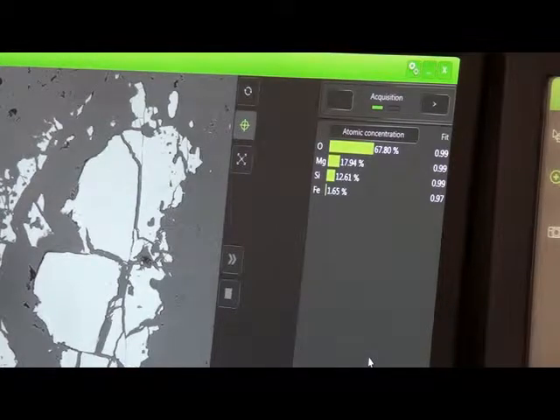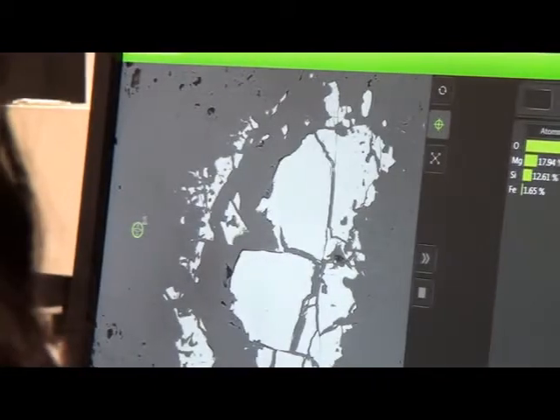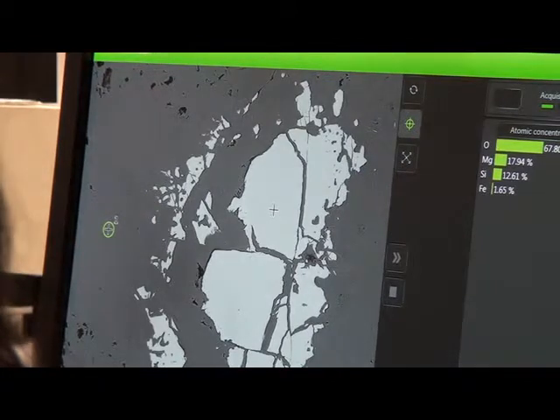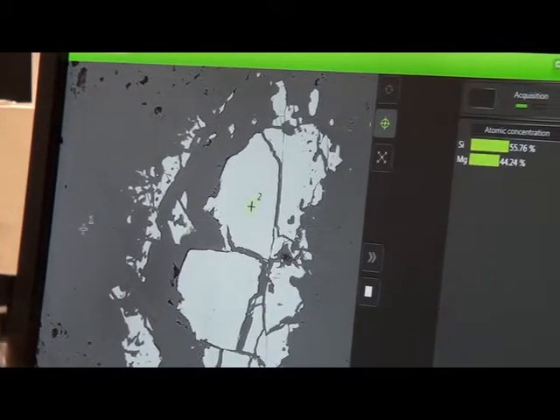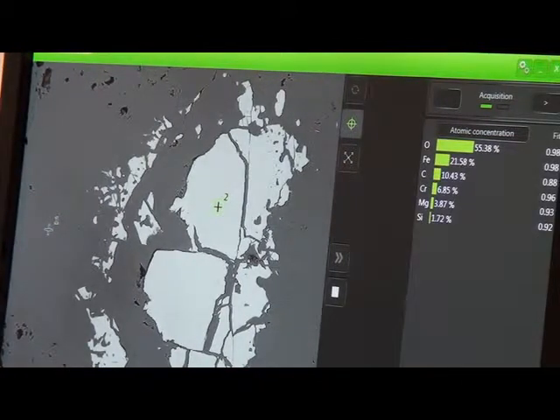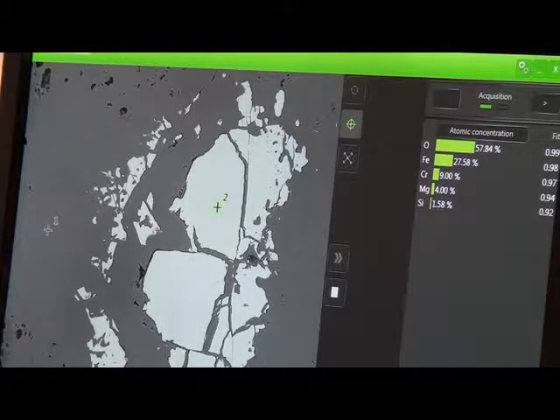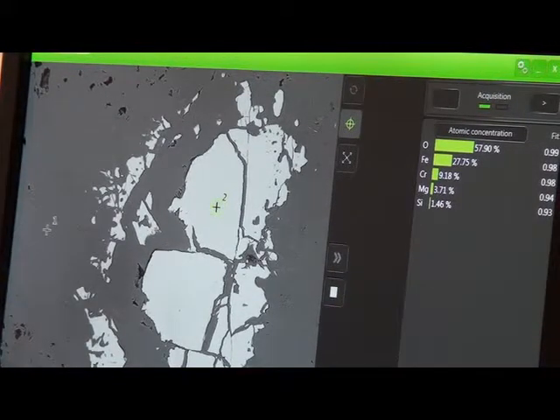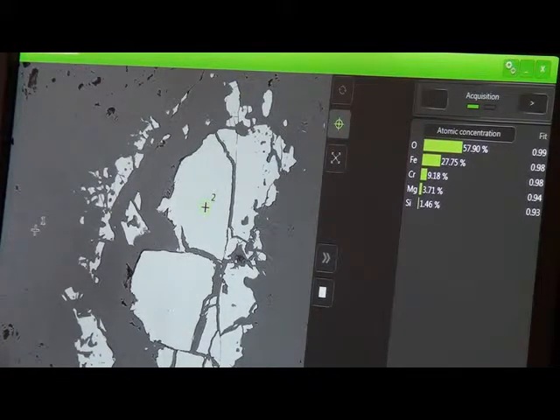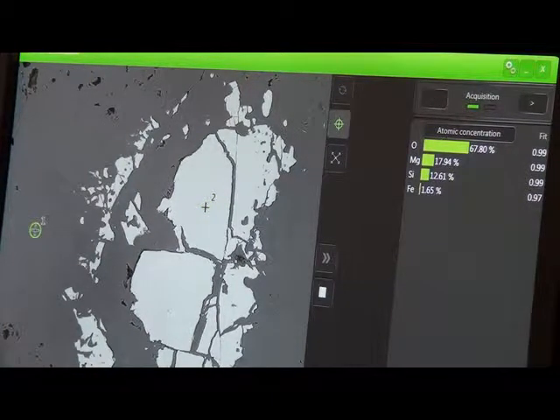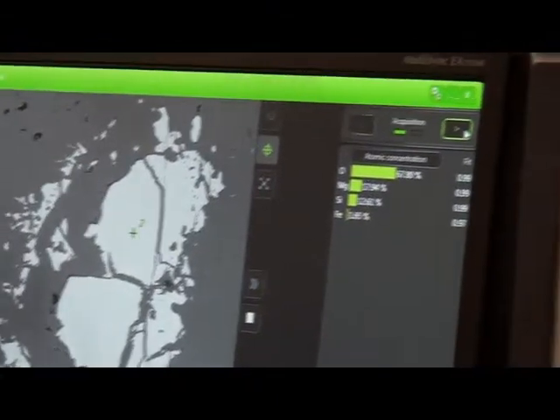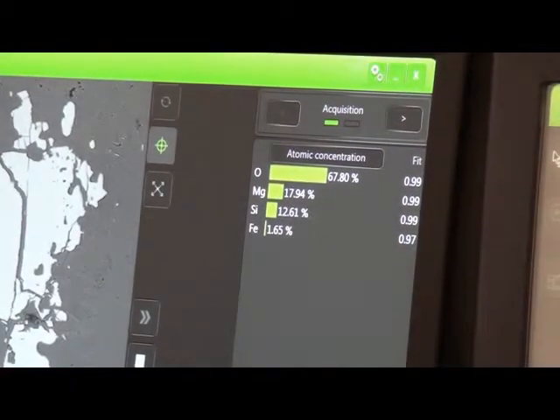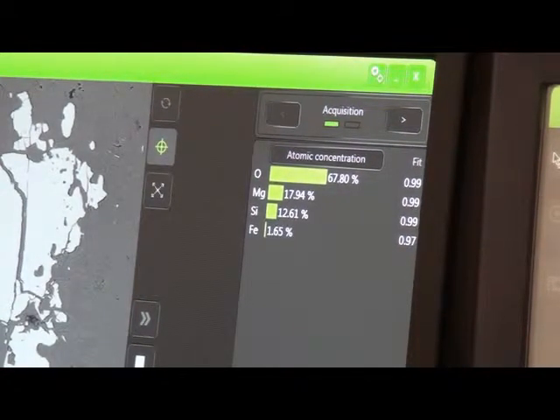Now let's go take a sample right in the middle of that bright area. Give that a go and see what we get. So if we want to, we can click back on that first sample here and look at the elements, and then look at the second sample. And what difference in elements do you see between them?